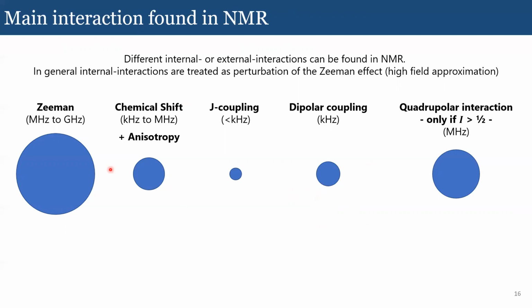After all of this, you're also dealing with quadrupolar nuclei, which means you have a spin number that is higher than 1/2. To give you a bit of context, almost 70%, 74%, of all NMR active isotopes are quadrupolar. So maybe not the most well-known interaction, but definitely an important one, especially in solids. In liquids, that doesn't exist, so you're lucky on that one.